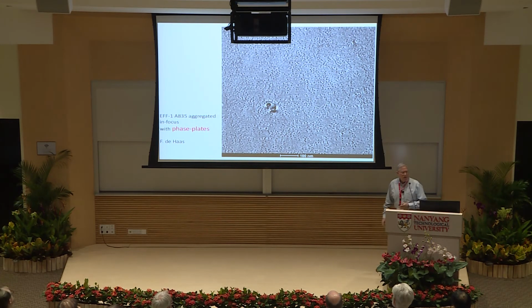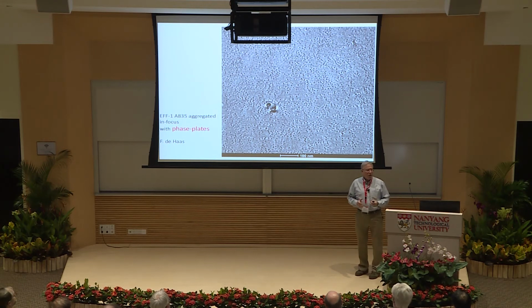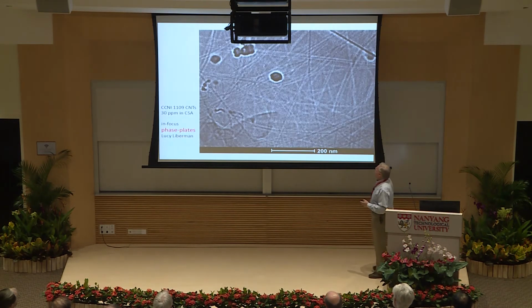Okay? I think it's a little better. And this is really a very important thing, because many of the objects that we are interested in, soft matter, really have very, very little contrast. And this is actually going to make a big, big difference in our work to come.